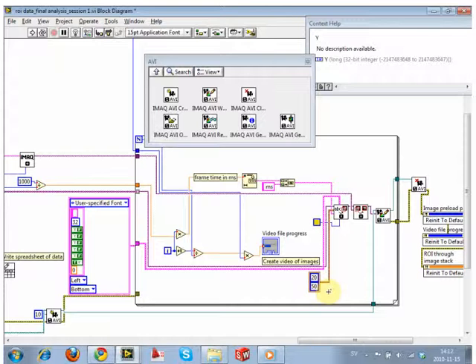And then you get to choose your color. But yeah, right now let's just see if it still works. I have no idea.